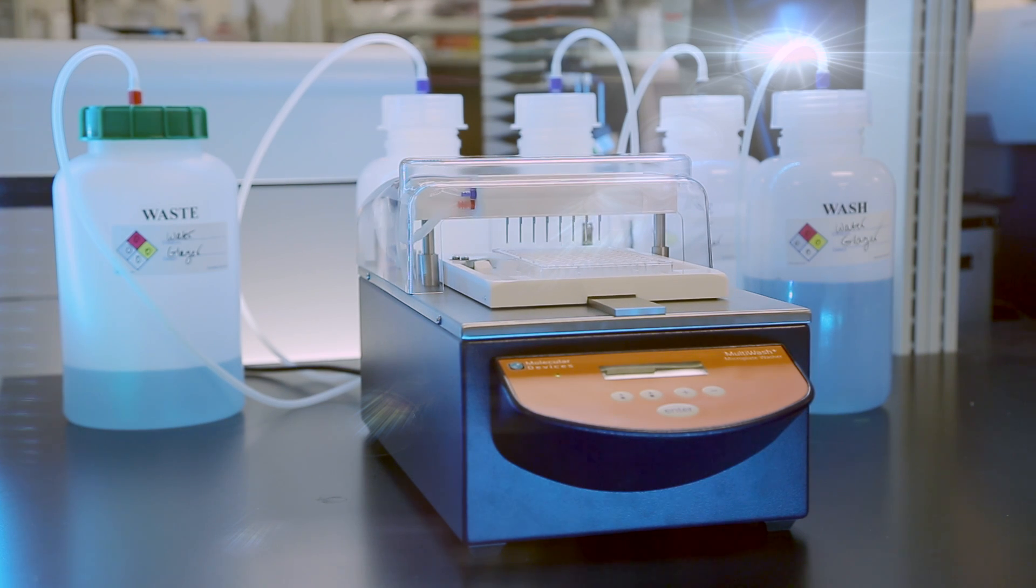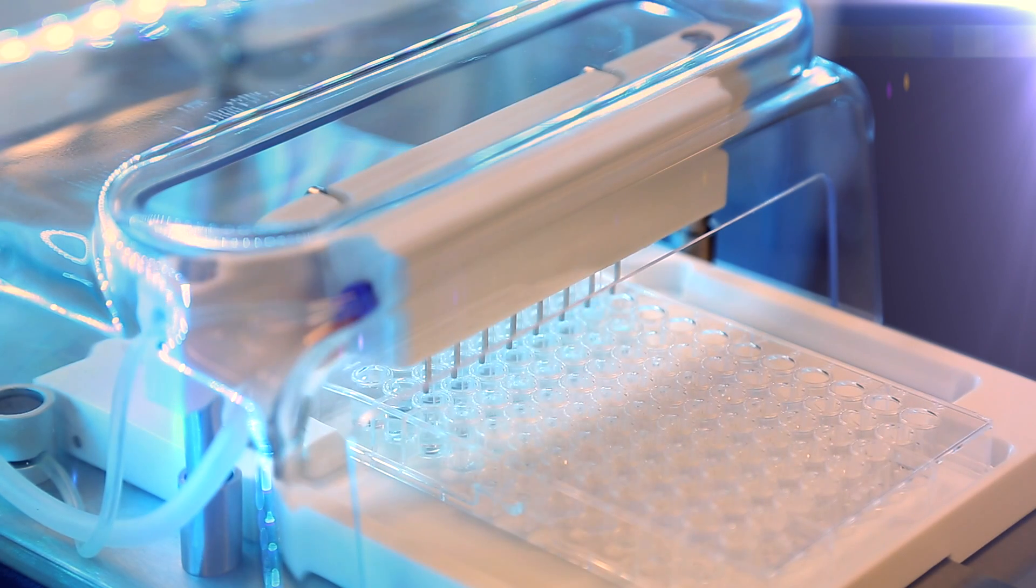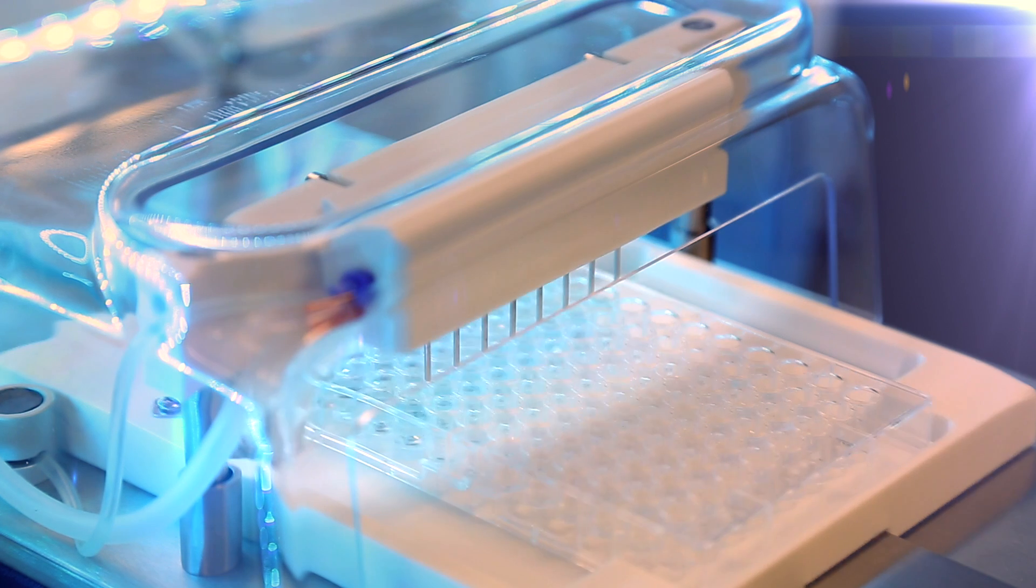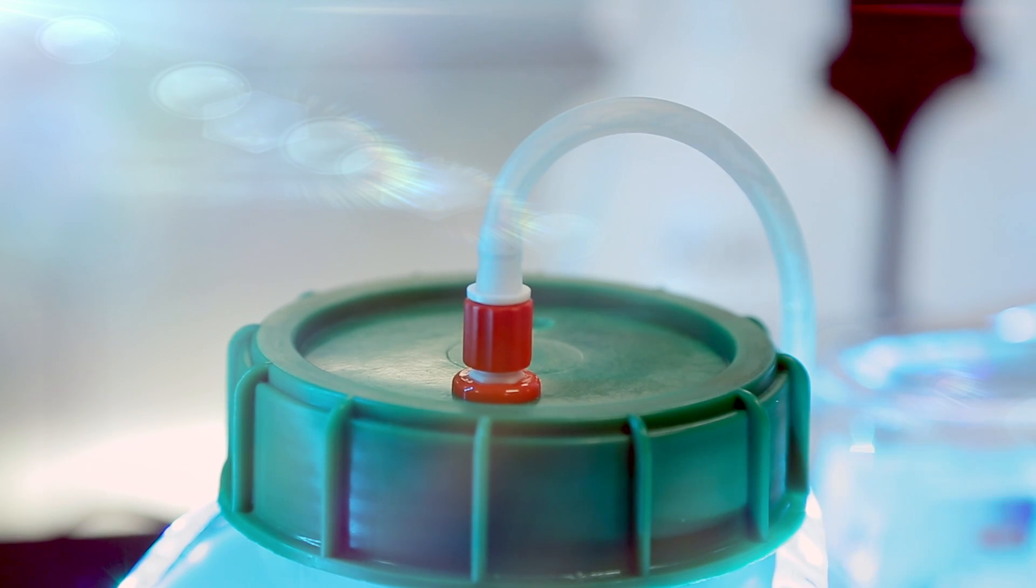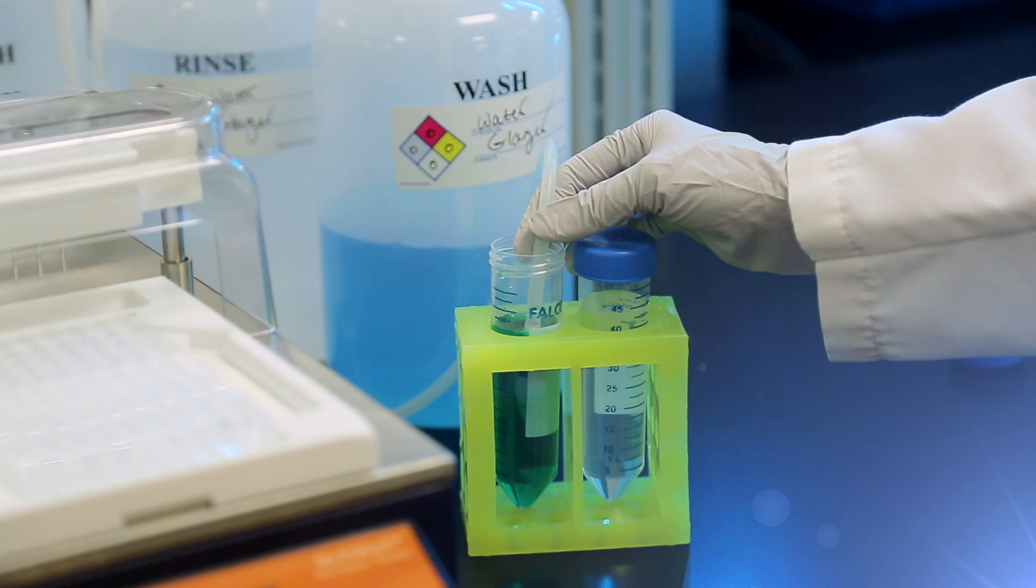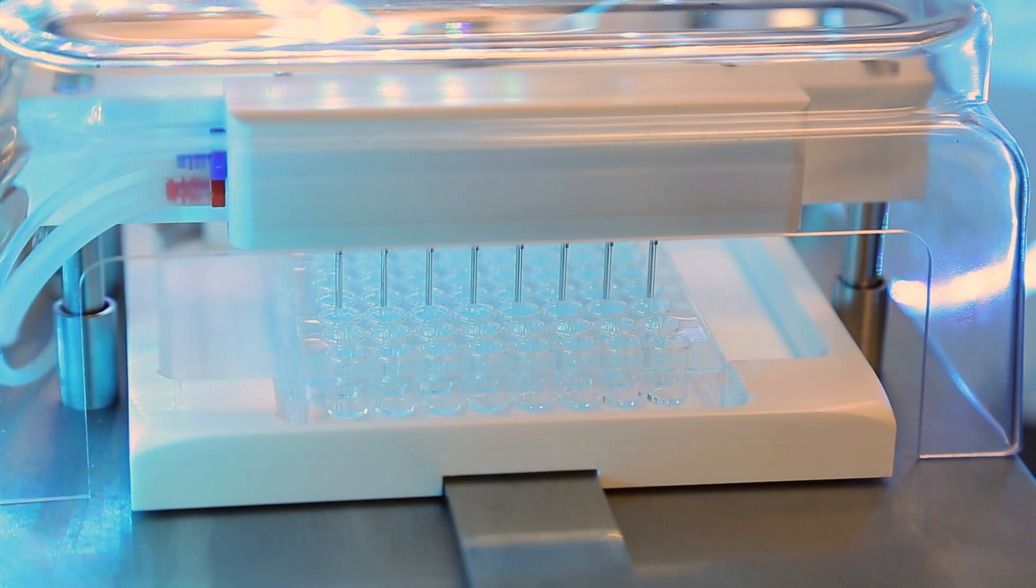ELISA plates can be coated using the dispense function of the Multi-Wash Plus. Low dead volume and non-pressurized bottles enable a variety of bottle sizes to meet your needs so that precious reagent can be saved.